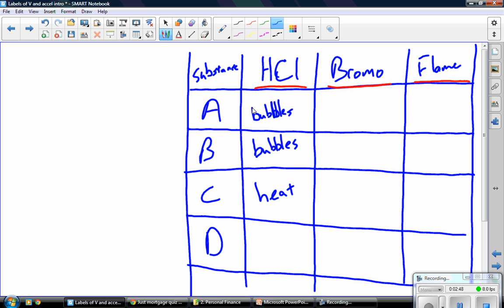Every year I get students who will say that. They'll see a couple little bubbles and say, oh, there's a bubble, must be a chemical change. And it's not. It's just air escaping, okay? So don't feel bad. Everyone makes that mistake. So with D, there really wasn't any. So no reaction.